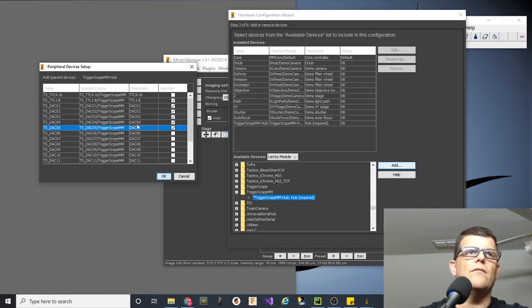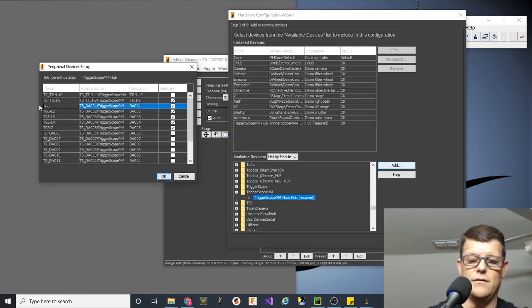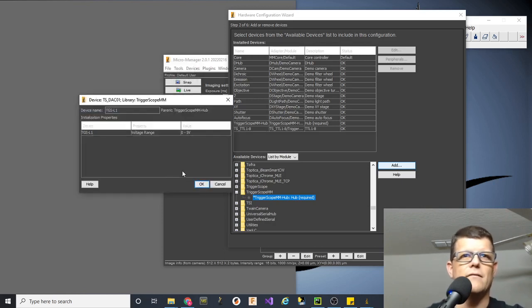So I don't know if you can name these here. I don't think you can. Hey, let's try. I've never done this before, actually. Let's try TGSZ. And here we'll call this like TGS Laser 4. They'll probably yell at me because I'm doing this live in a video demonstration, which is a big no-no. But I like to live on the edge. All right. Let's see if this thing blows up. Yeah, that's kind of cool. It didn't. All right, so device name, TGSL1.